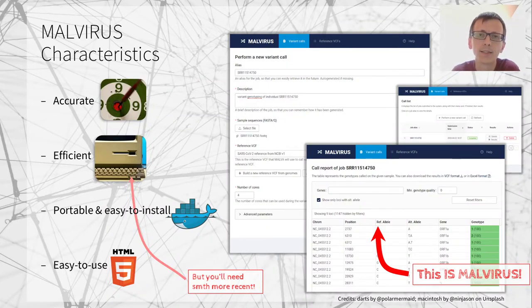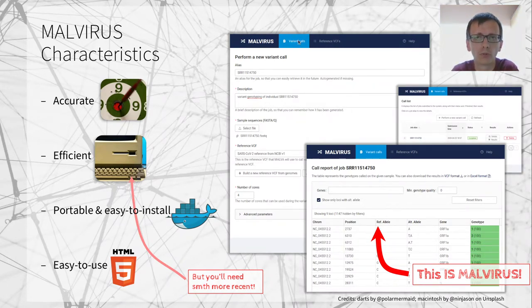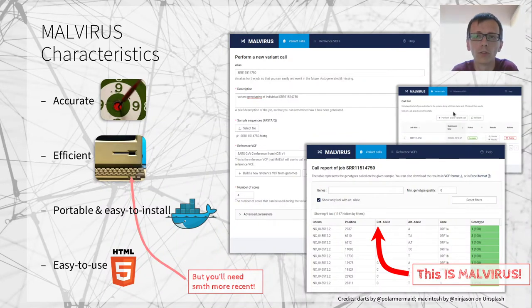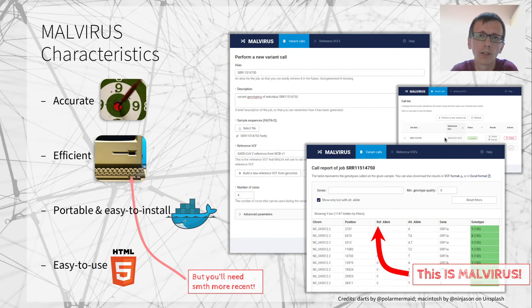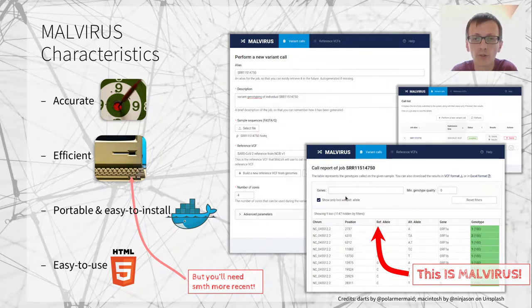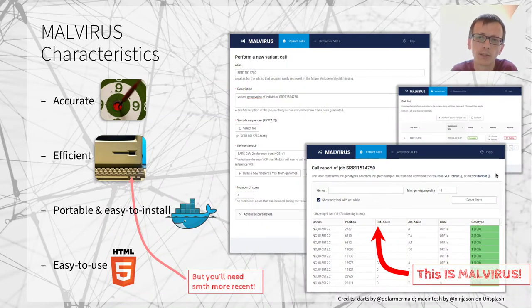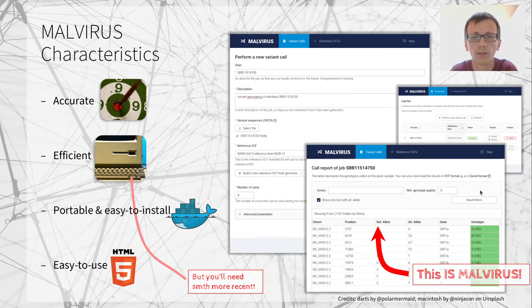Finally, it's easy to use because it guides the researcher through the task of performing a new variant call, as you can see in these screenshots. It shows the list of submitted jobs, and we can also view the results inside the application with filters and so on. Results can also be downloaded in Excel format for further analysis.